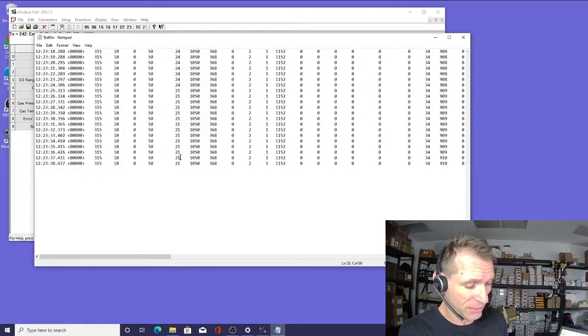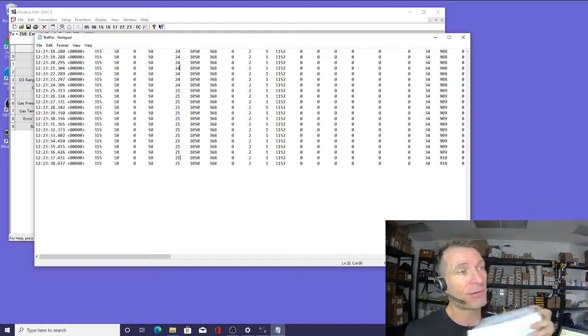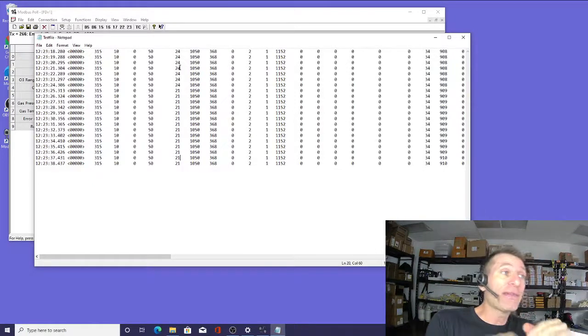So the instantaneous reading was number 4. Okay, so you could check your user manual, and it's clearly labeled. Number 4 is the register, which is 1, 2, 3, 4. This one right here is our data reading, folks. That is where the data is in parts per billion. So you could then export that into Excel and then do the data manipulation that you wish, folks.